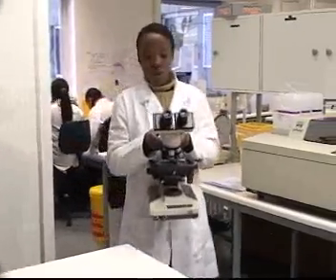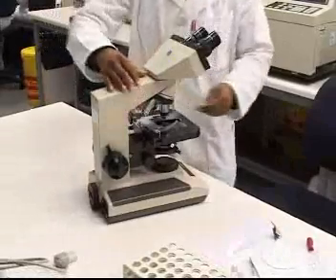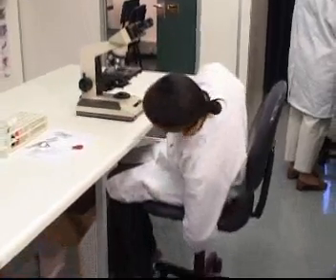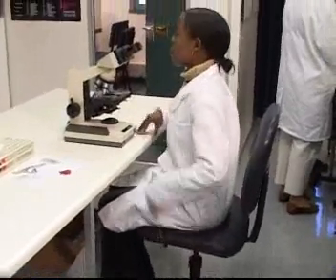Let's start by setting up the microscope. Firstly, remember to carry the microscope by the arm to prevent it from falling when you're moving it around. Place the microscope near the edge, but not on the edge of your laboratory table with the arm facing you. It will be easier for you to see through the eyepiece if you adjust your laboratory stool to suit your height.